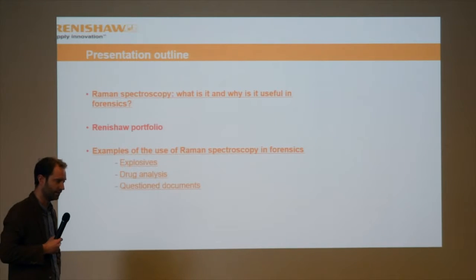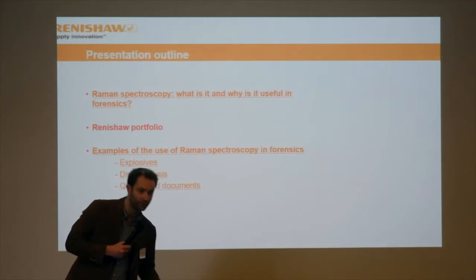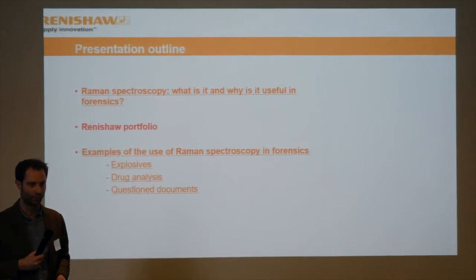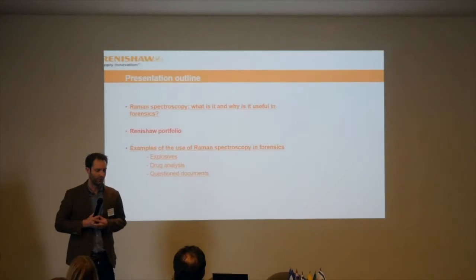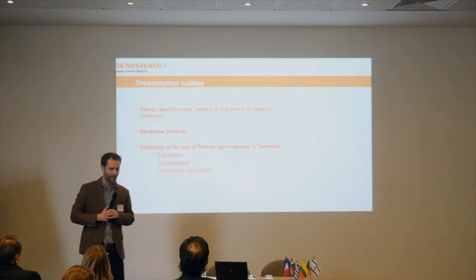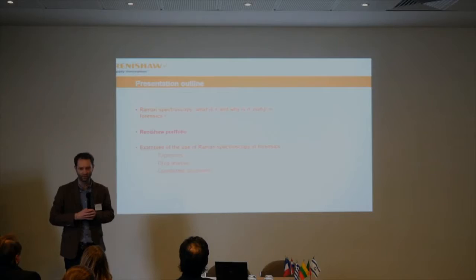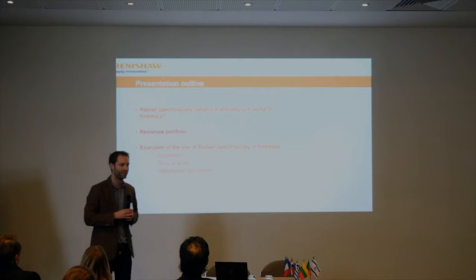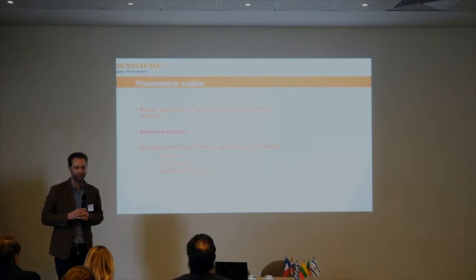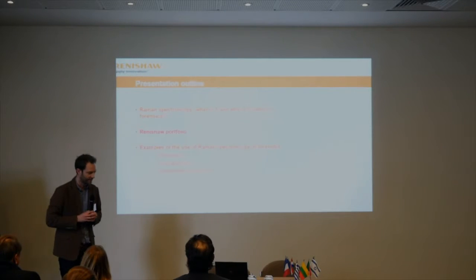I think we fall under tender requirement number 2, if I've noted correctly from Mia's presentation yesterday: the toolkit must allow further analysis of recovered trace. So from what I understand, the sample needs to be taken out from the toolkit to be analyzed on a Raman. That would be correlative microscopy in effect. And I have to agree with the previous speaker, it's sometimes quite difficult to do, especially on a micron level. But it's certainly possible to localize a particle, put it on another system, and have it within the field of view of the objective, especially if you do things correctly, like keeping references.